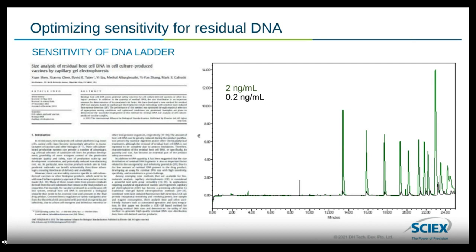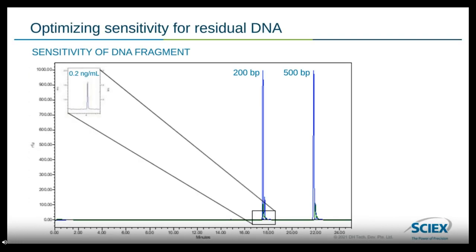And by following some of those parameters, not all of them, I was able to easily achieve sensitive and reproducible separations well below that 1 nanogram per mL range. And I understood that had I followed everything they were doing, I would have likely achieved even far greater sensitivity than they were able to. But how can we put that great work to work for us?